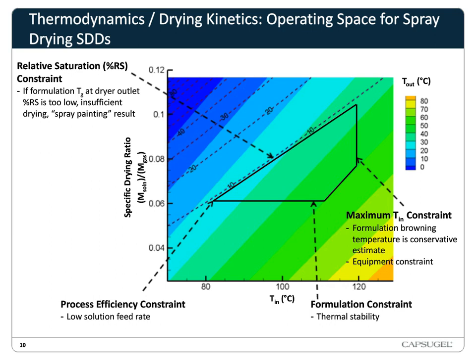The material properties are things like the drugs' and polymers' thermal degradation temperatures, and the resulting glass transition temperature of the dispersion, including the residual solvent, based on the calculation of the relative saturation of solvent at the outlet of the spray dryer. The process is constrained by throughput on one end, and then what we like to call spray painting the dryer on the other end. That is, if you don't dry it fast enough, it all sticks to the sides of the spray dryer. Now within this space, we can start to engineer our particles.